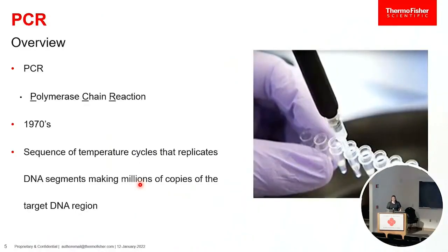Thanks, NIH. So when we work with DNA, there are times where we want to measure and understand what's going on. And logically in this process, we ultimately want to get to the point where we understand qPCR. But to understand qPCR, we kind of have to make a stopover at PCR. So PCR is polymerase chain reaction. It's been around since about the 70s. It was a lot more difficult to do back then. We can all be happy we're doing it today and not 50 years ago.